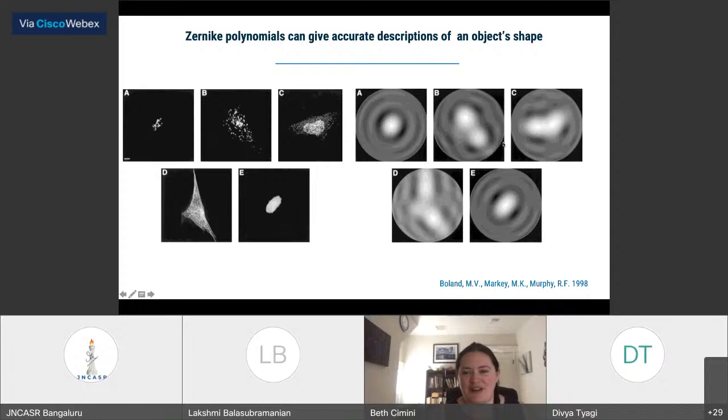The left and the right aren't exactly equivalent, but compared to simpler measures like the orientation and the perimeter, we're getting a much more detailed view of what each of these kinds of shapes look like. While these measurements are really difficult for human brains to intuit, they can be really valuable for higher level mathematical analyses of shape, which again, I'll talk more about in a little bit.